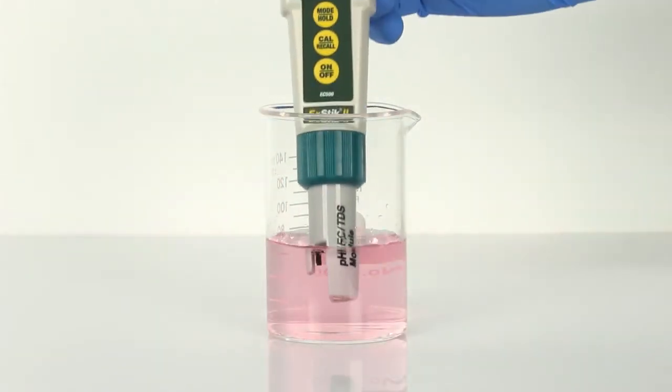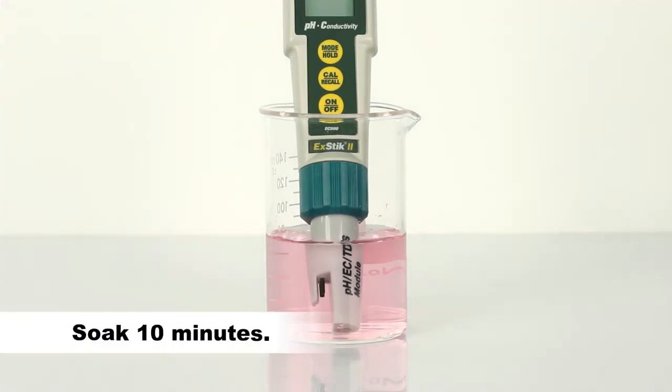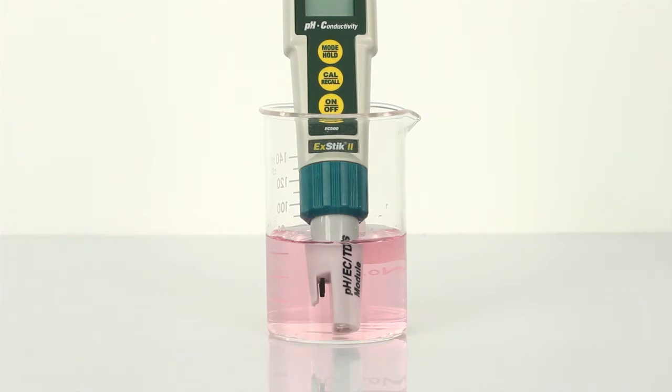Before the first use or after storage, soak the electrode in pH 4 buffer solution for about 10 minutes. White potassium chloride crystals may be present in the cap or on the electrode. This is to be expected depending on the length of time in storage. These crystals will dissolve while soaking the electrode, or they can be rinsed away with tap water or distilled water.